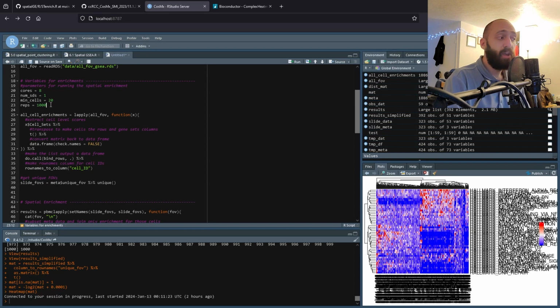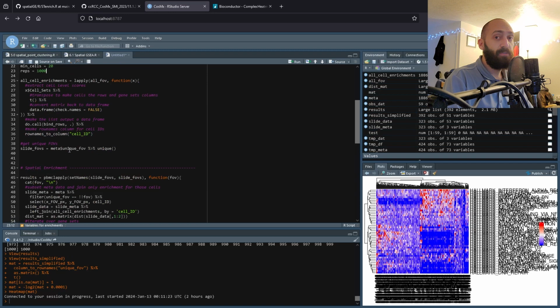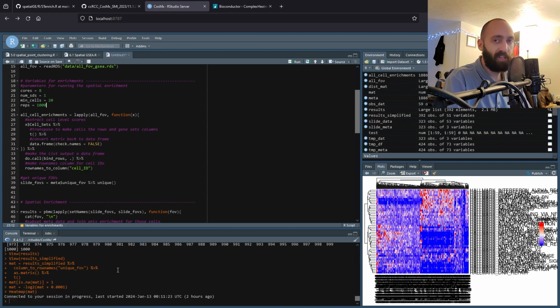And like I said, with the method that I have here on 45 through 77, if you feel like you need more permutations, you get a more granular p-value for the gene set spatial gene set enrichment analysis, so feel free to bump that up a little bit. If you have a cluster, you can go hog wild and get a very accurate p-value. Some of them are borderline, which more permutations might help, but I think 1,000 permutations is fair.